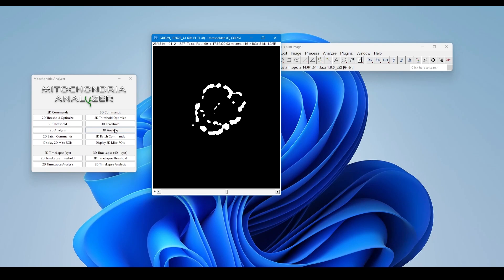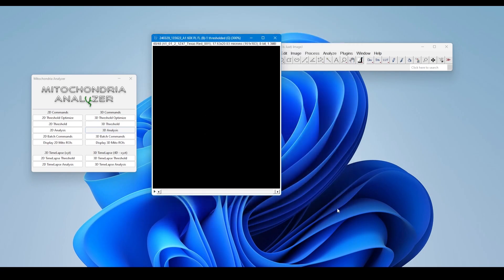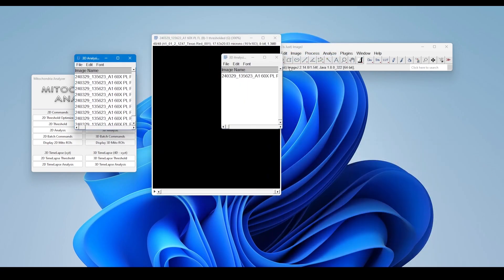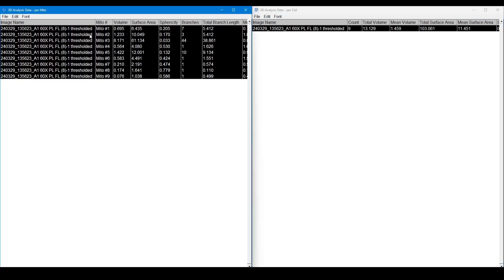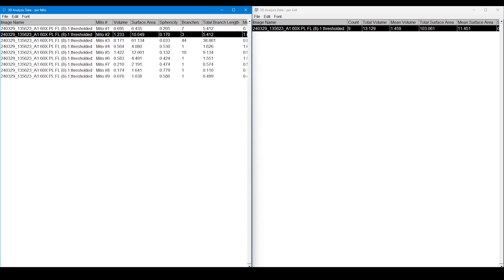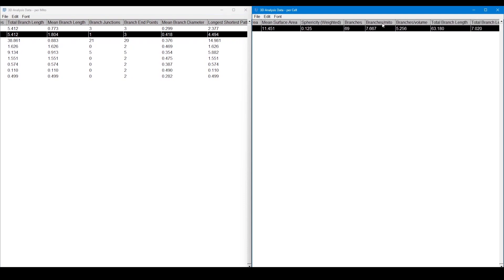Here's another way to analyze your mitochondria: the 3D analysis option on the mitochondria analyzer itself. I personally like to pick the per cell and per mitochondria mode to perform the analysis, so I can save both CSV files that are generated. Here you can see two files are produced — on the right is the per cell normalized counts and volume, and on the left is each individual mitochondria's dataset. You can then do further analysis, looking at different sizes of mitochondria across your experimental groups. When you set up the mitochondria analyzer, it will ask you to download all the dependencies, and all that information is in the user manual.